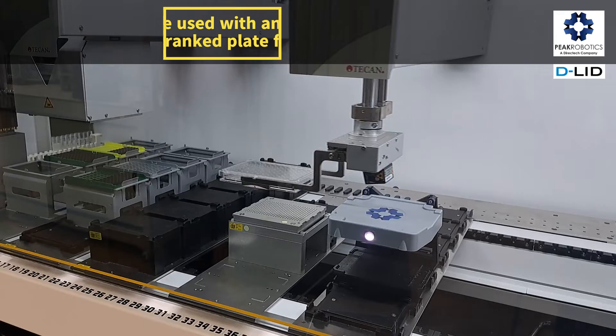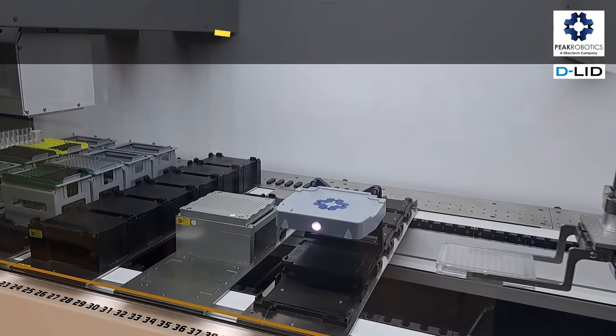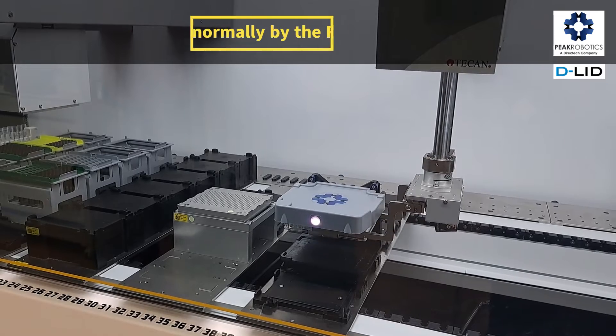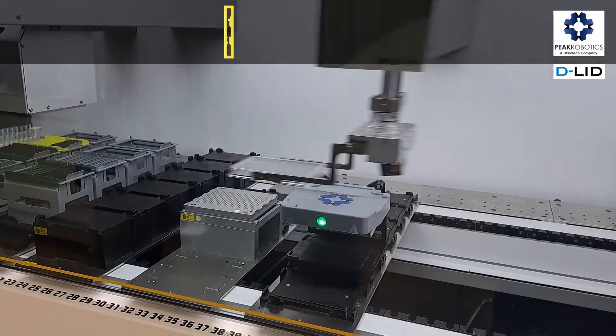The D-Lid can be used with any liquid handler with cranked plate fingers. Plates are handled normally by the Fluent Plate Gripper and are presented to the D-Lid for delidding.